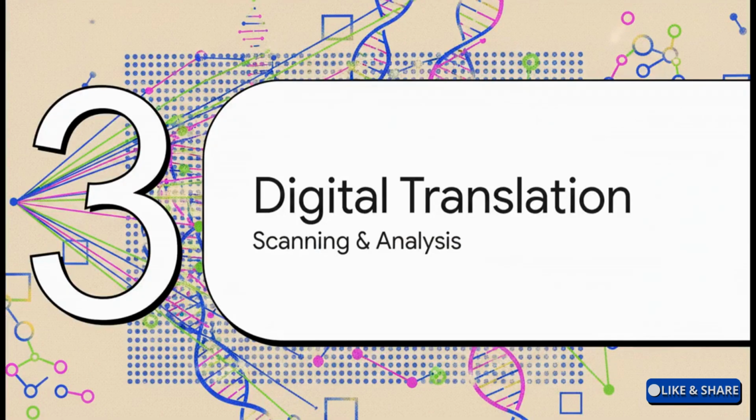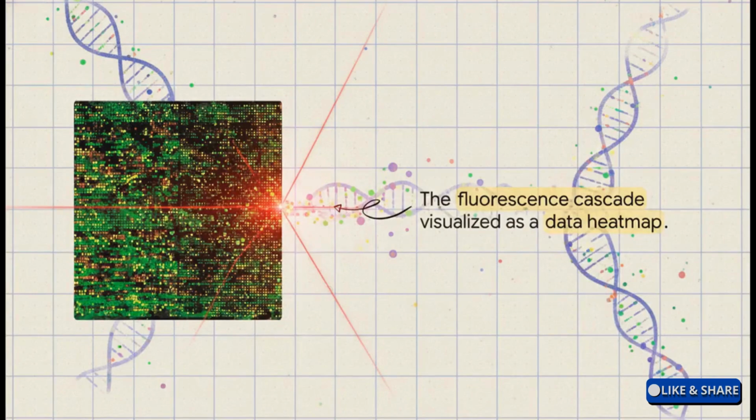Section 3. Digital translation, laser scanning, and data analysis. With the hybridization battle complete, we zoom out slightly. A precision laser sweeps across the slide, exciting those molecular dyes. A high-resolution camera then instantly captures this glowing grid, calculating the raw luminescence intensity for every single dot on the chip. What you're left with is the raw, visual fingerprint of a living organism's active genome.